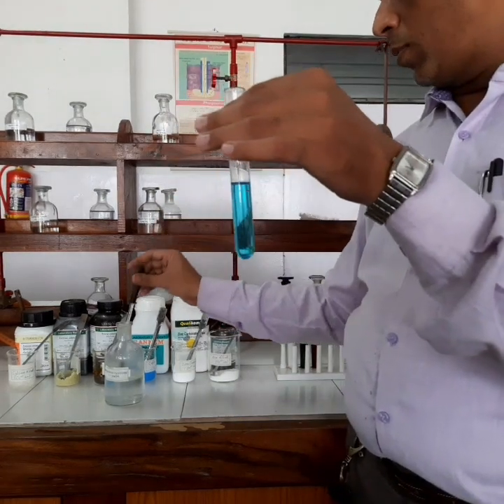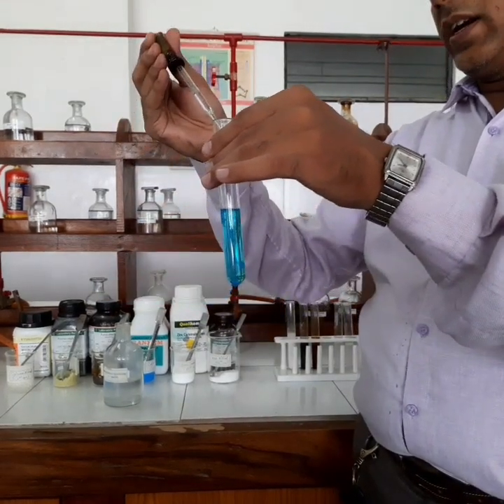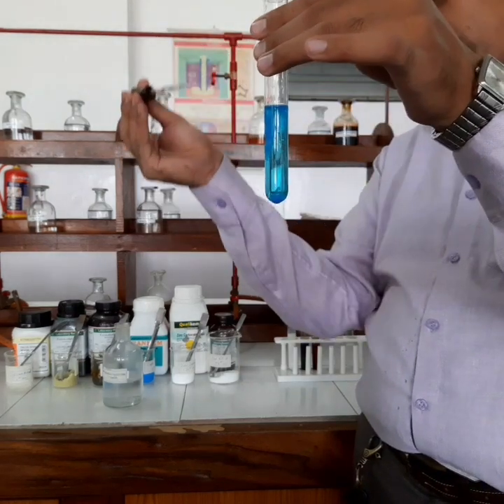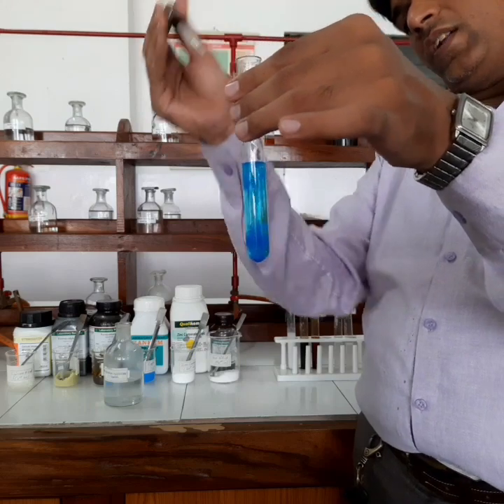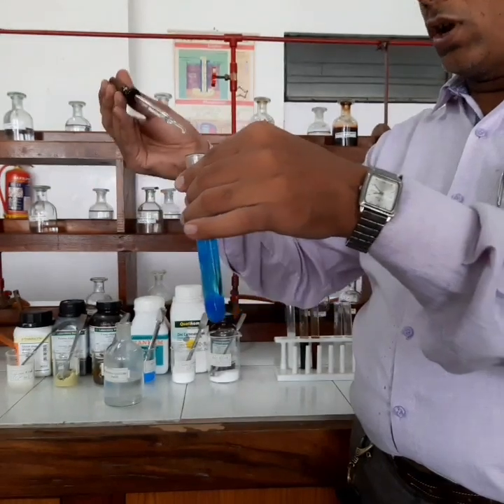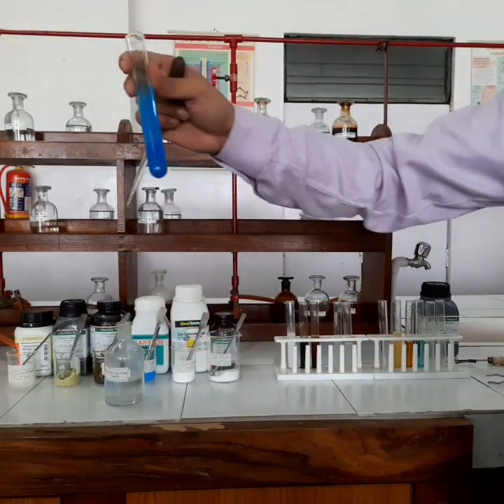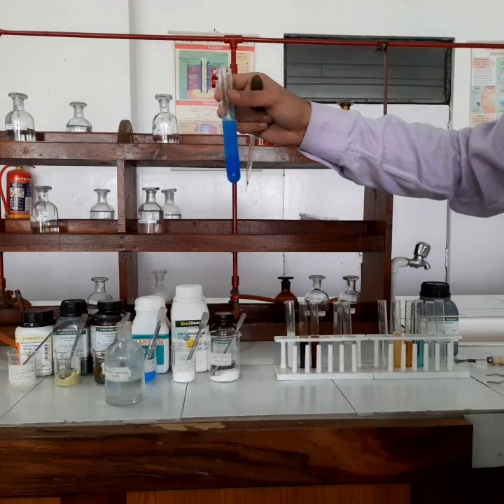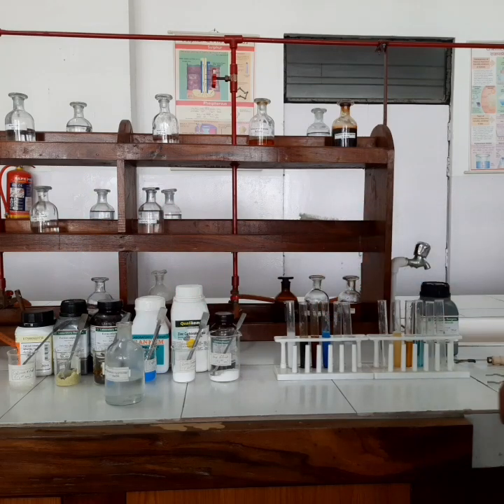Now this is the solution of copper sulfate, and we are going to test for copper ions. See, on adding NaOH in small quantity, a pale blue precipitate of copper hydroxide is forming. And this pale blue precipitate will remain insoluble in excess of NaOH also. So this is going to confirm copper ions. With the help of this we have confirmed the cation copper, because copper ions form a precipitate of pale blue color with NaOH in limited quantity and also in excess.